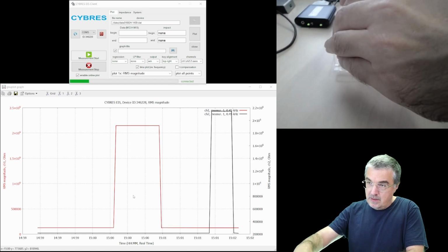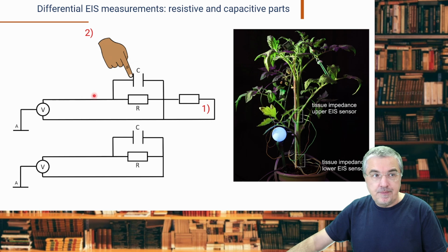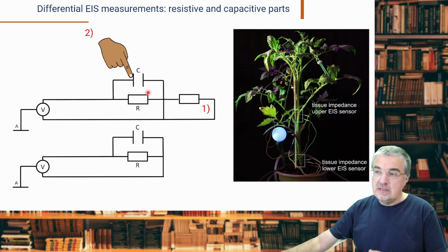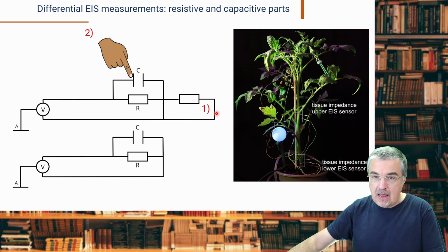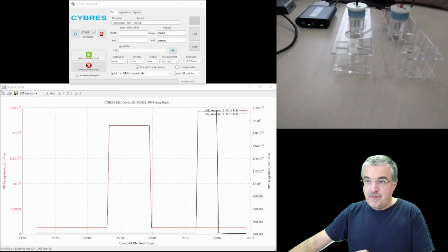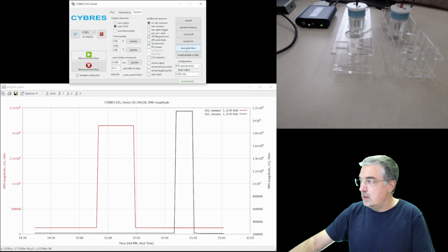Now I will try to demonstrate the second point. If we have a capacitive change in the setup, what will happen then? For this, I will again unscrew and touch, and add my body capacitance to the system. So once again, I start a new data file.